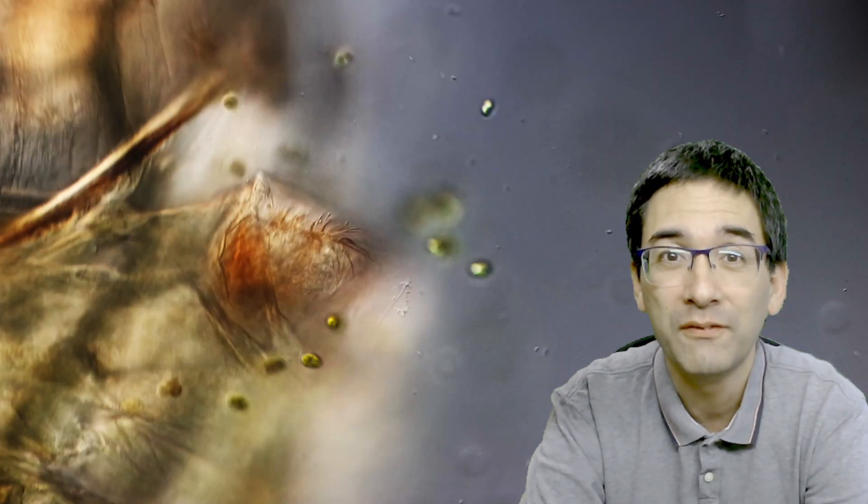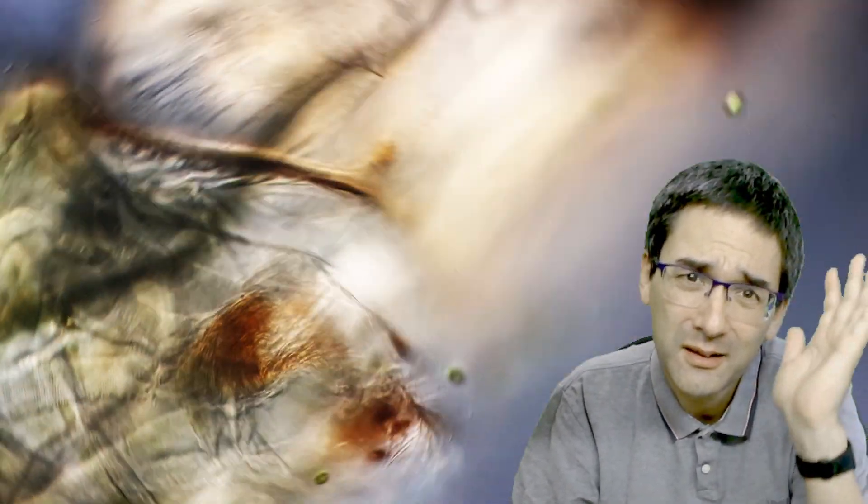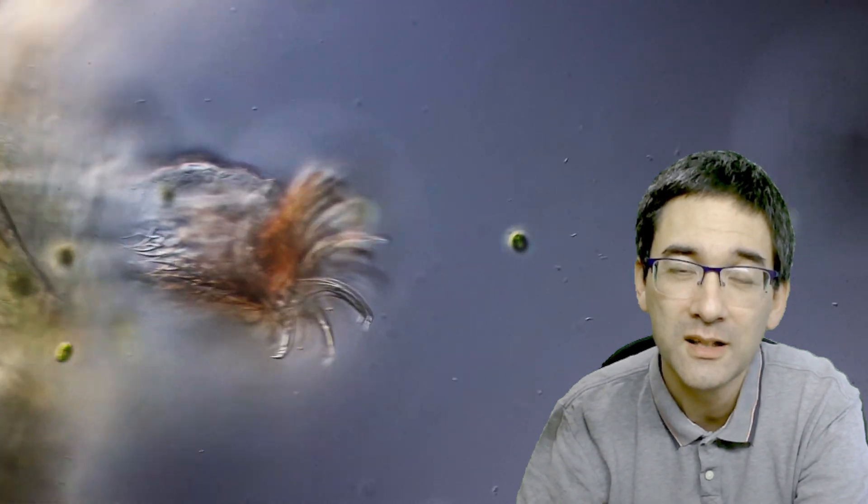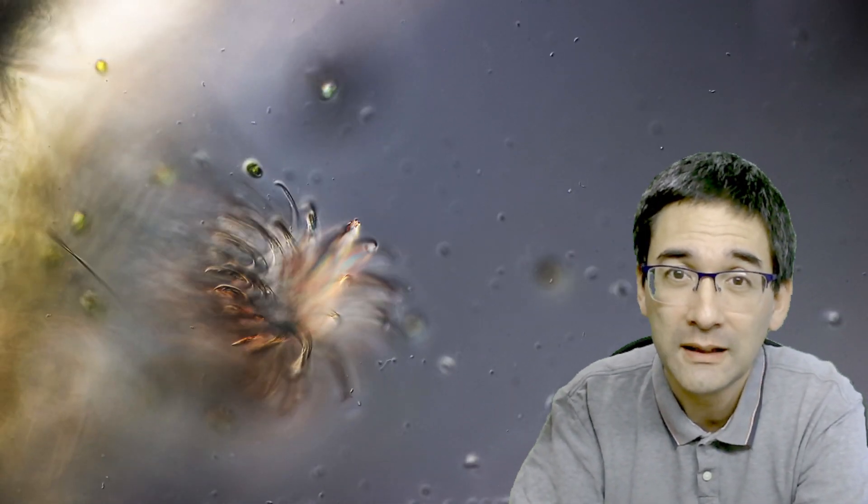But then after a little bit of research, they discovered that these are the so-called van der Waals forces that allow the gecko to move up the wall. Van der Waals forces are very weak interactions between atoms. I think maybe as a working hypothesis, maybe we have a similar phenomenon here as well, because those hairs are so small and so tiny that there's a large surface area. This maybe allows the feet of the larva to make very good contact with the smooth glass slide.